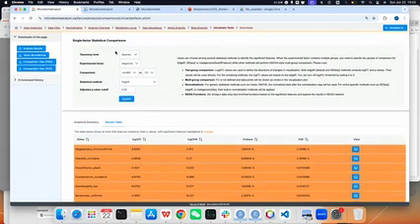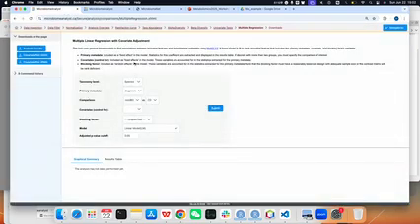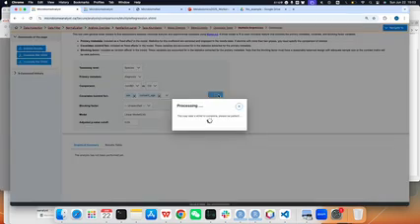This is for the single factor analysis, and a more commonly used method is MaAsLin, which can consider the covariates. So here we use an example. For example, we use sex and age as covariates, and then we submit.